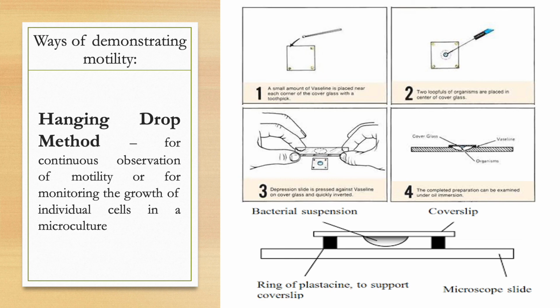All right, so any bacteria in that drop of liquid, you will be able to see them if they are moving. Okay, and you should not confuse the movement of bacteria using the hanging drop method with Brownian motion. So to differentiate them, you have to look at your bacteria and you observe the type of movement they are showing. Okay, so if it's like an independent movement or if they're moving at different directions, the different bacteria, then we can consider that as true motility.